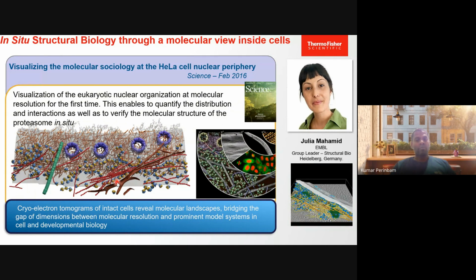So you are able to see it in a single snapshot. As you can see on the lower right bottom, you can see the video of how the reconstruction of the image has happened.